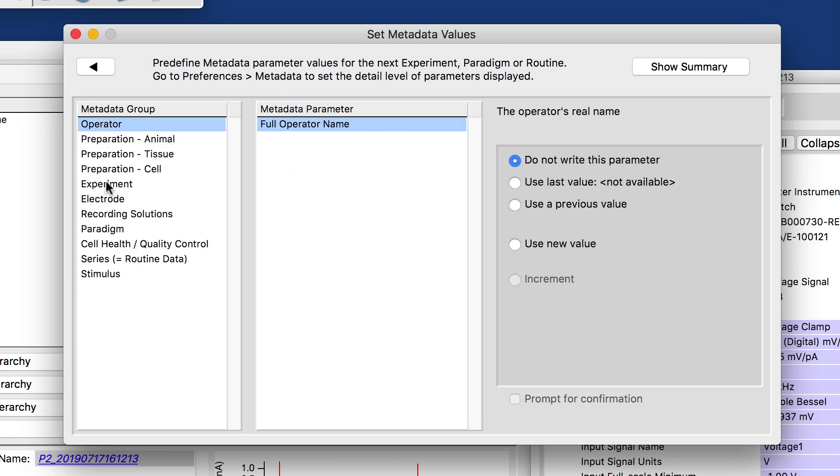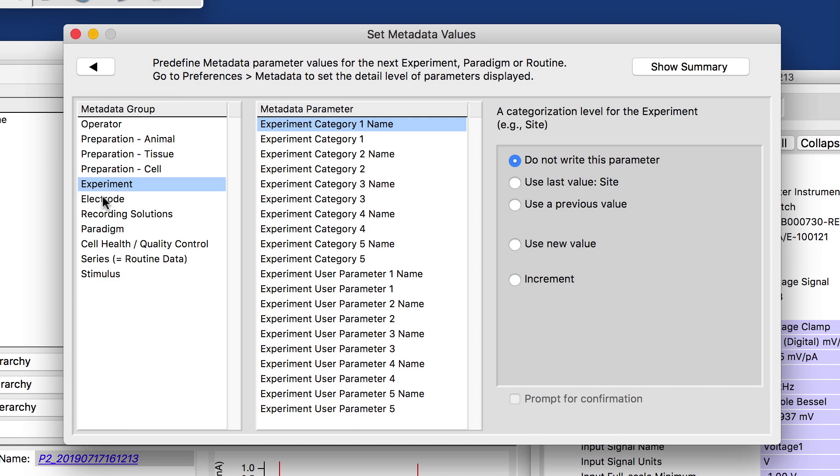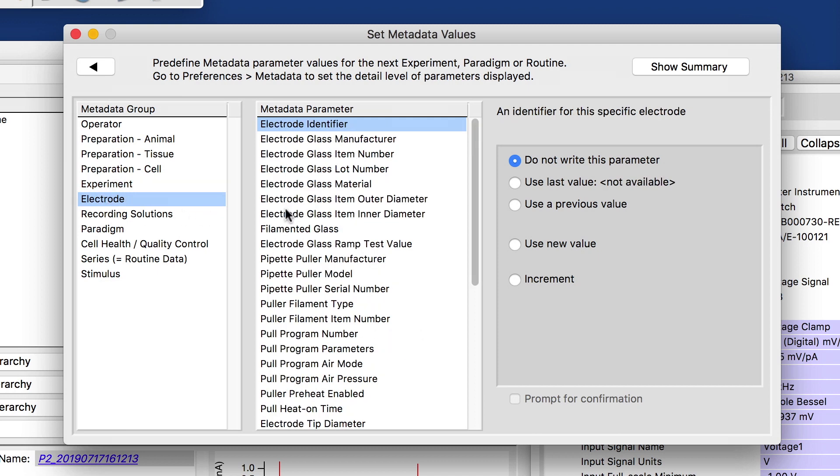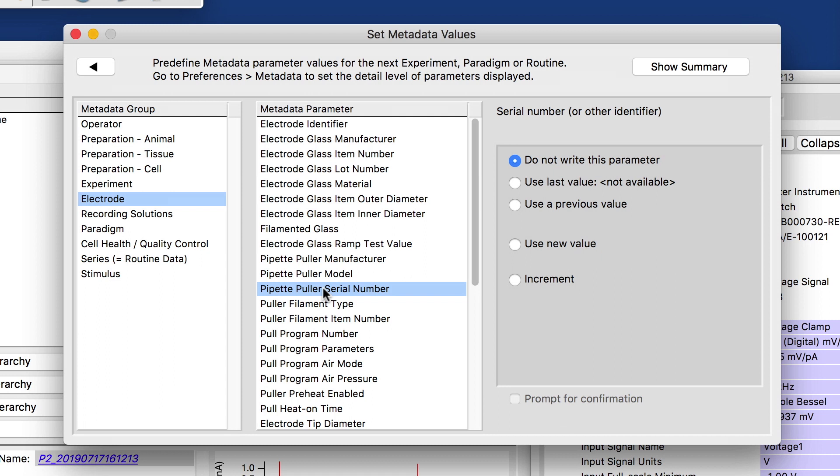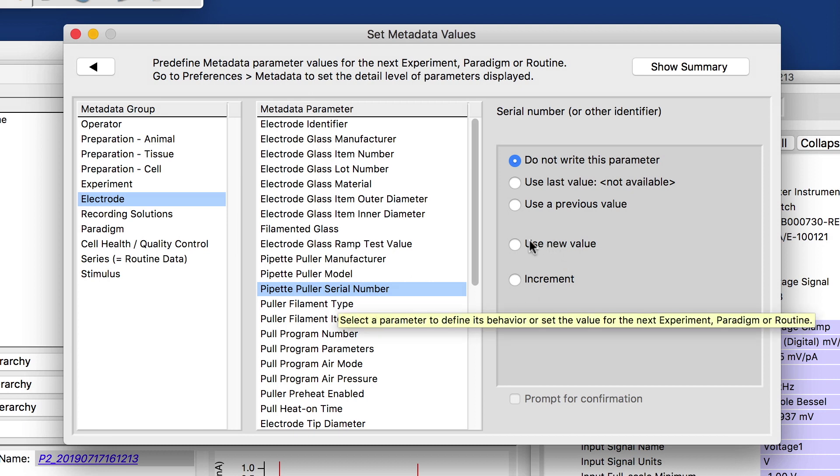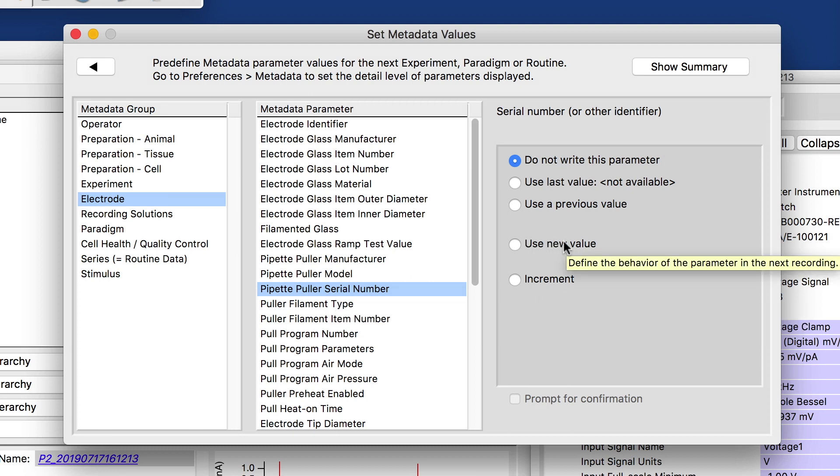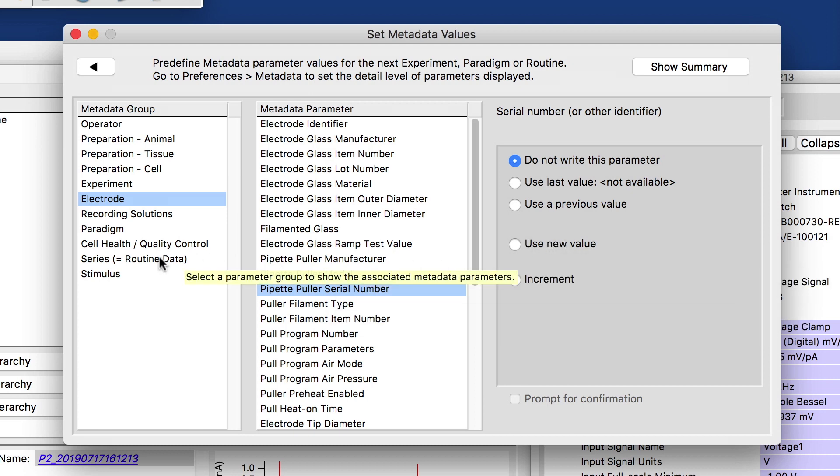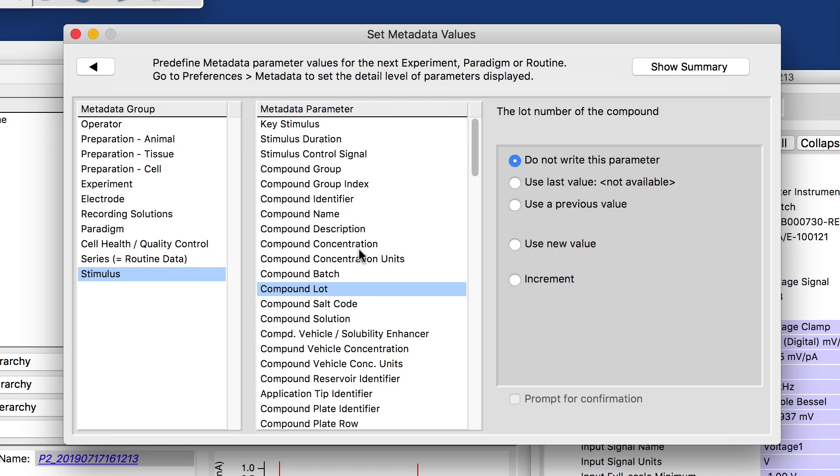So here we have more fields, the operator, the experiment, the electrode. I mentioned that earlier, for example, the pipette puller. If you have three pullers and one of them always gives me smaller currents than the other one, which will be kind of odd, but you could track the serial number, you can add information about the stimulus, compound concentration, the compound lot, things like that.